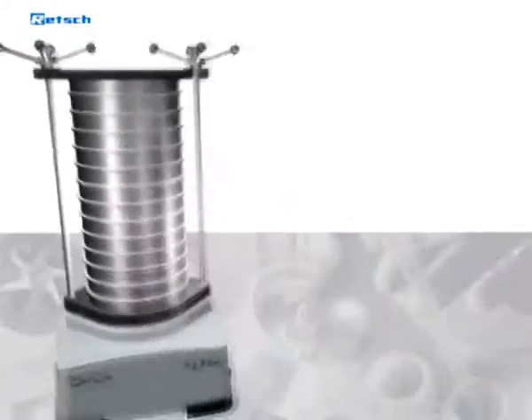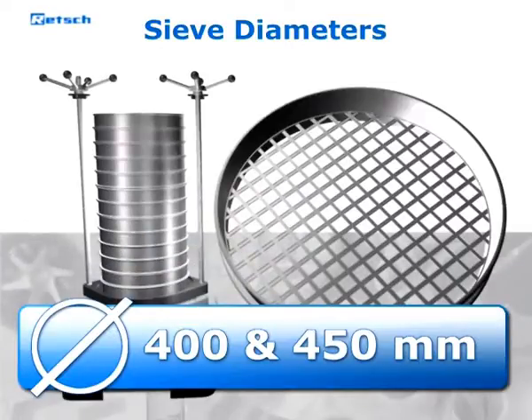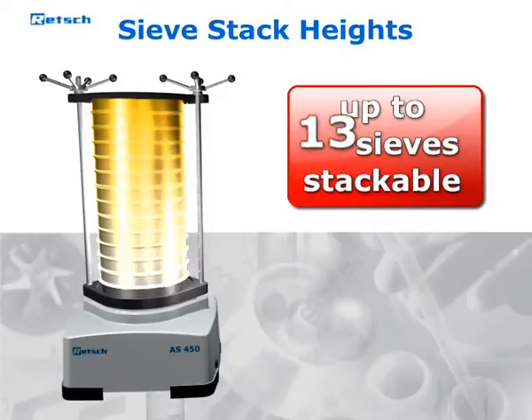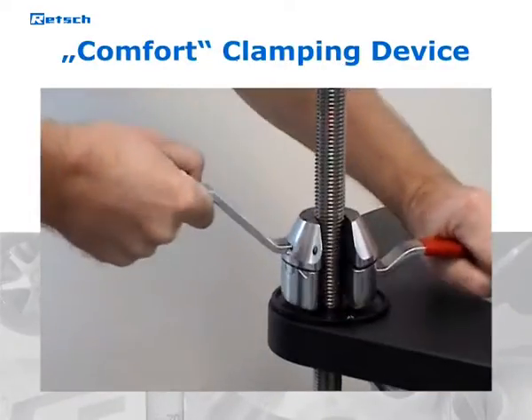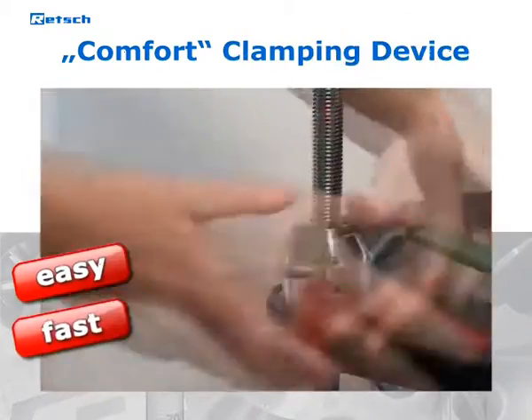The AS450 is suitable for sieves with diameters of 400 and 450 mm and sieve stack heights of up to 13 sieves. The AS450 is also suitable for wet sieving. The optionally available comfort clamping device allows for easy, fast and safe handling.